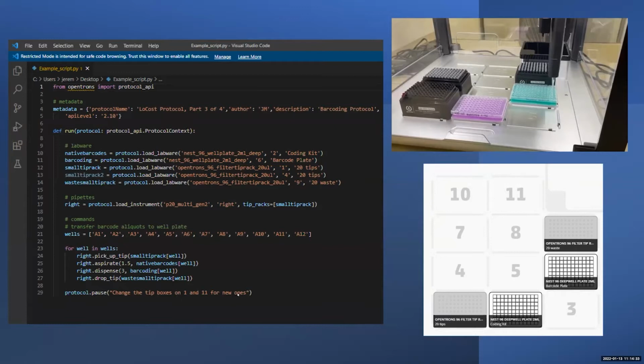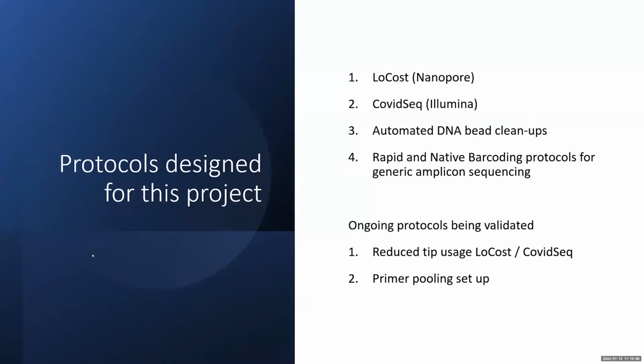And then within that function, you will set what the labware is. So at each position, you will basically designate a type of labware. And the OpenTrons API has a number of types of labware that are predetermined. So it already has base calibration settings for them, so it can recognize these. I'll show you something a bit later, how we're able to use this and manipulate this when using the robot. And then after that, you will define what pipettes you're using and then the actual run itself.